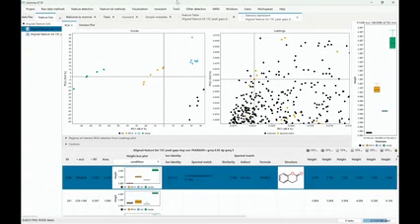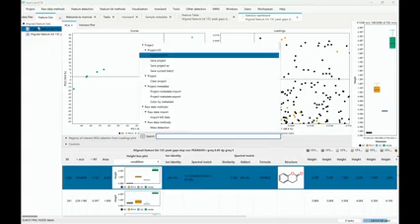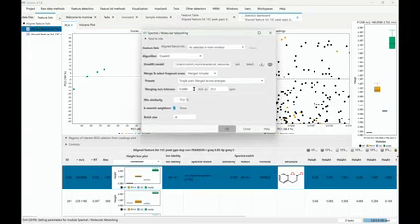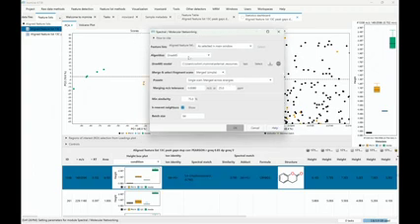And if you want to play around with that, you can always select the feature table. We quick search and we say molecular networking. And you're going to find that usually you're going to see a lot of parameters. We try to keep it minimal. But if we search for molecular networking, you don't have to do this now, but later, just check it out.